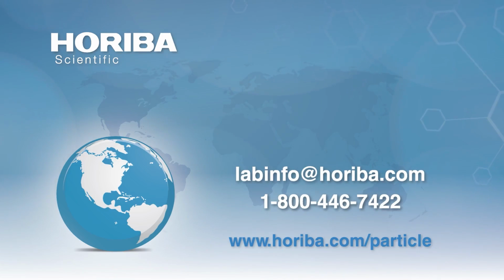So we talked about high concentration. This person would like to know, what is the lowest concentration limit for measurement? Well, again, that's going to be determined by the light source that you're using. Because when you use any kind of a light source and a detector, you want to be in the linear range of its response. In other words, if you get too high in concentration or too low, you're no longer going to be linear, which means that Beer's law is not going to hold. So the instrument itself knows what those limits are, and when you do the run, it will tell you if you've gone outside the acceptable limits. Okay, perfect.